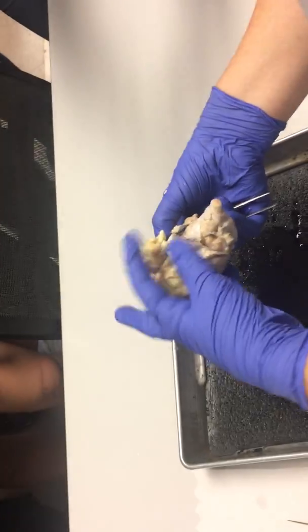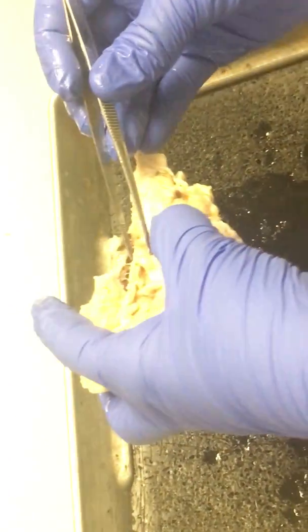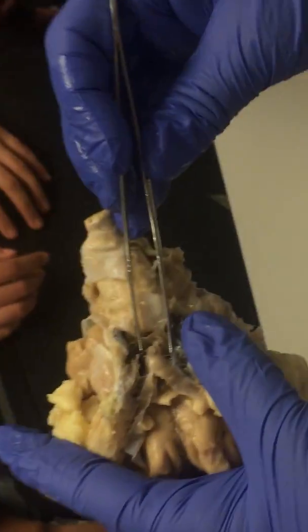The optic nerve comes from the back of the eyeball and carries visual information to the visual cortex. Here, we have the pituitary gland right there — that little thing right there.